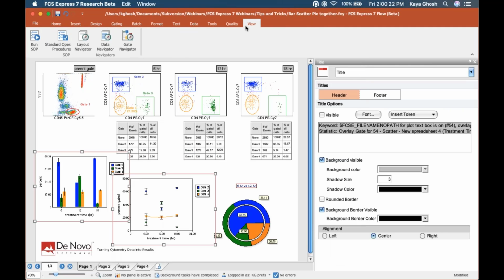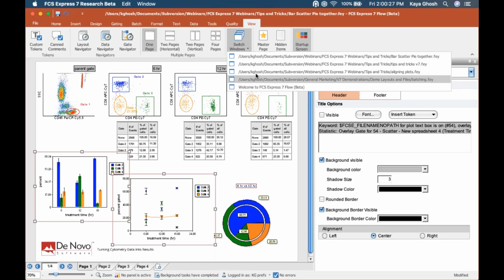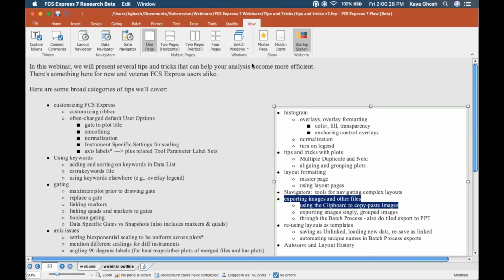So let's see, what else? So now we're going to talk about, we're almost done here, and thanks for sticking with me. This is a very interesting webinar because it's like a mishmash of things.